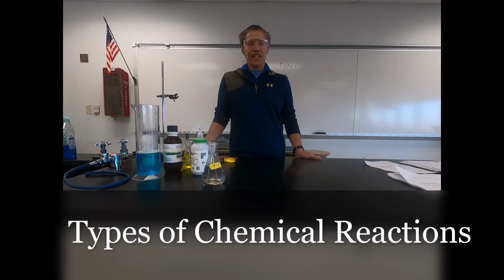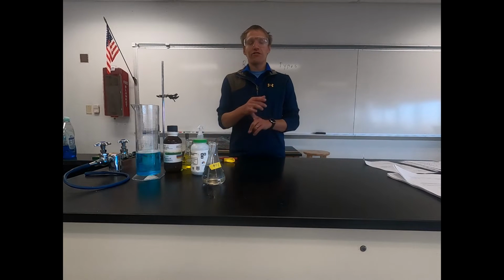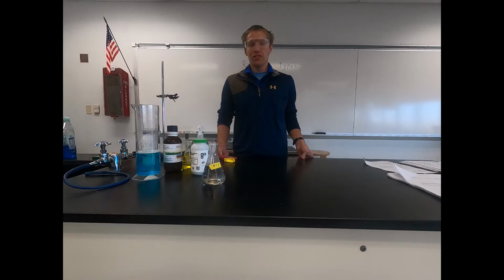Hello, and in today's activity, we're going to be looking at different types of chemical reactions. We have 5 different types of chemical reactions we'll look at: single replacement, double replacement, synthesis, decomposition, and combustion. So we'll do one example of each and see what happens in those different types of reactions. So we'll do a demo for each one, starting with single replacement. So we'll catch you in a second.